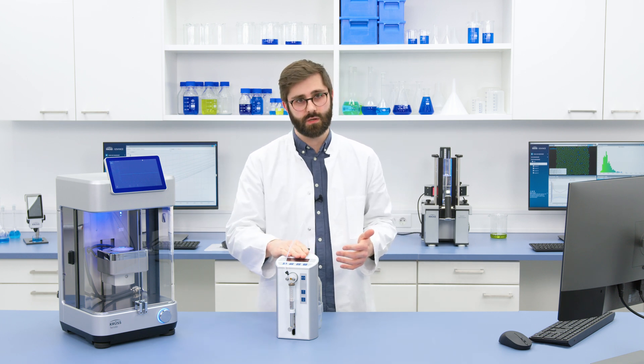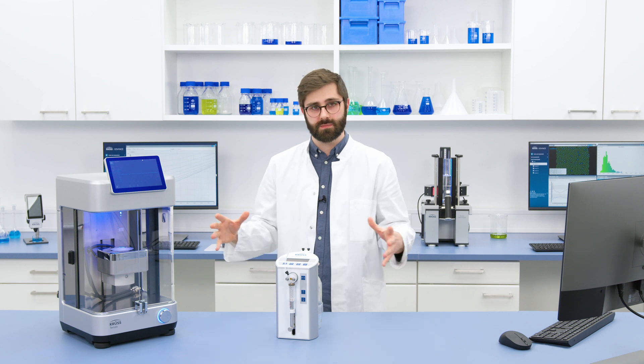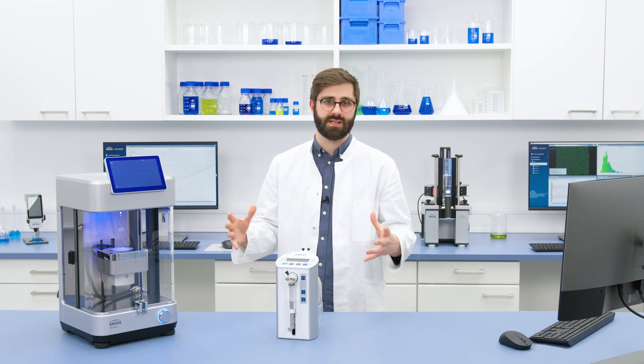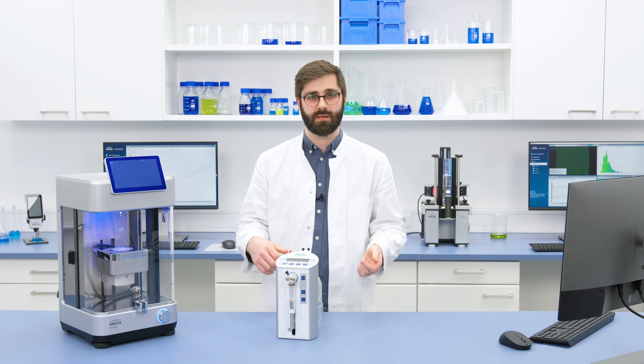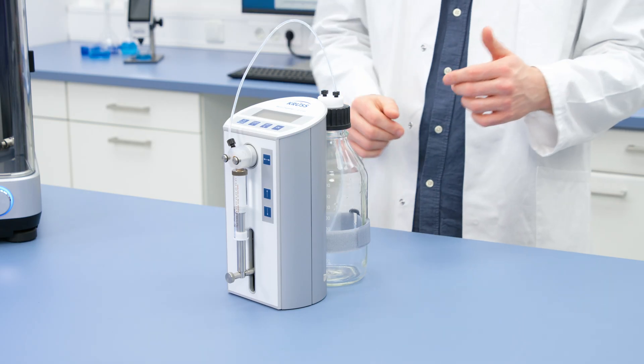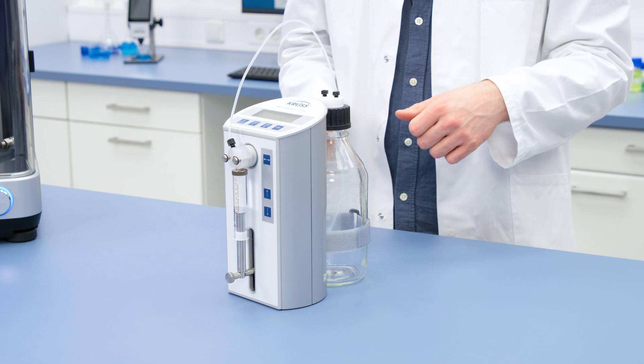With an automatic dosing unit, you can have this completely automated and you're not using up the time of the person. So they don't have to sit by the instrument and change the sample every time. It will change the concentration—it can either dilute or concentrate your solution.